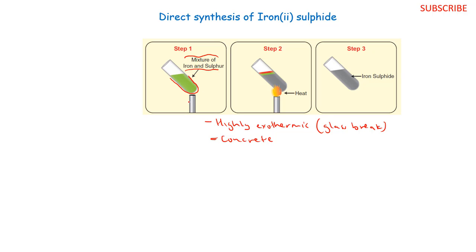So we shall do some little heating until our sulfur will melt. Remember, sulfur is in powder form. All we have to do is to ensure that we melt it into sulfur liquid. So that's why we are applying heat on step two. Basically, this reaction will take place when our sulfur is in liquid form. And then the reaction can be sparked off, and then we shall form our black iron(II) sulfide.